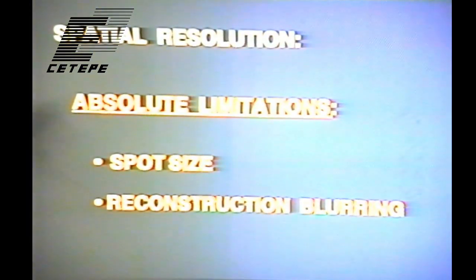In terms of what limits your spatial resolution, we already mentioned that in X-ray imaging, it can never be better than your spot size. Okay, so no matter how you set things, oh, I'm sorry, that's not true. It can be better than your spot size in certain geometries, but if you want to use high magnification and put the object close to your source, like we were talking about for microfocal work, then it becomes limited by your spot size.